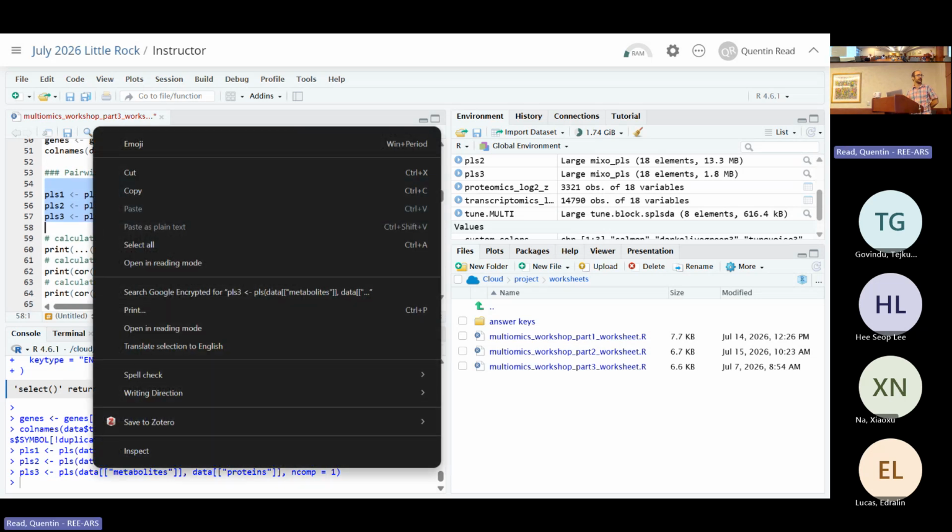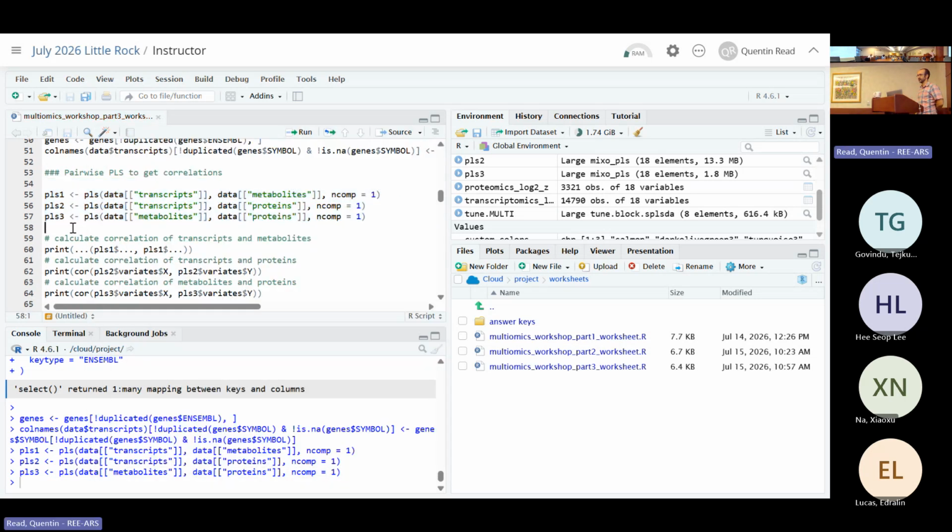You could probably, even if you were really anal about it, do some sort of cross validation to figure out the optimal ones to put in here, but that's way overkill for what we're doing. If you really cared, you could do a cross validation to optimize this value. But I tried out different ones, and honestly, the results were basically the same every time anyway. So I'm not even sure how much difference it makes in practice, at least in this case.